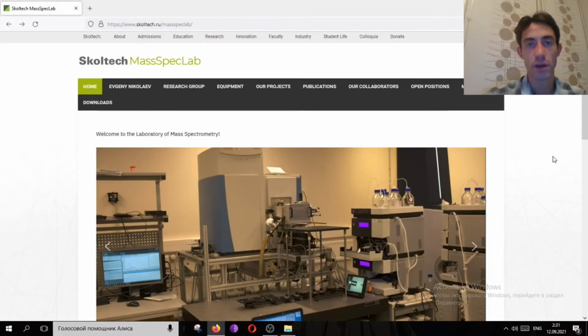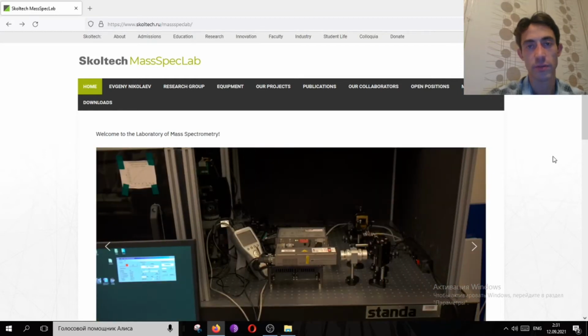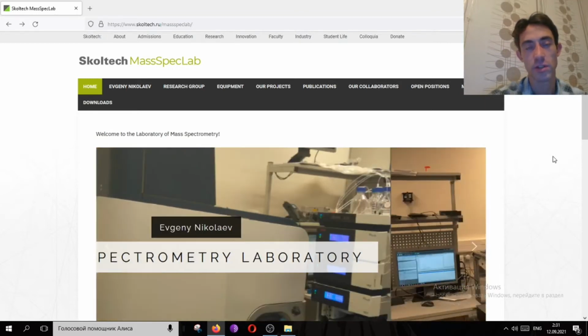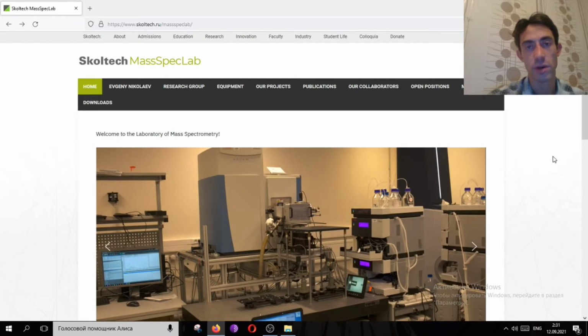Hello everyone, I'm Yuri Kostukevich, Assistant Professor of Skolkovo Institute of Science and Technology, and this is the second part of a tutorial dedicated to PyFragMS software that we are developing in our laboratory. In the previous part I was talking about the area of research, why we are developing new software, and what kind of problems it can solve. Now in this part I will show you how it works.